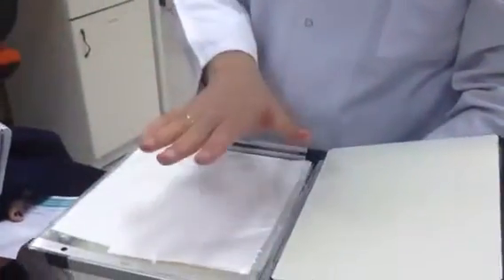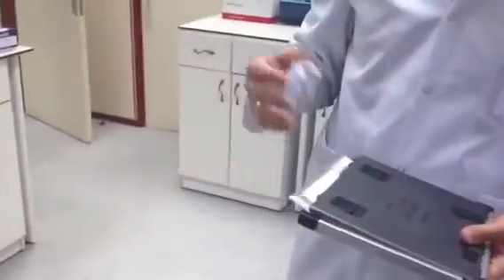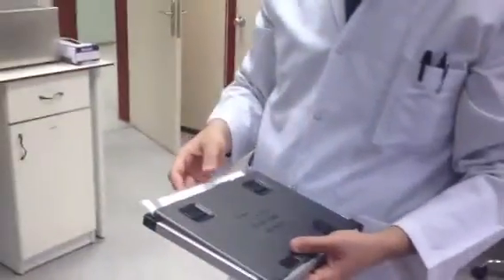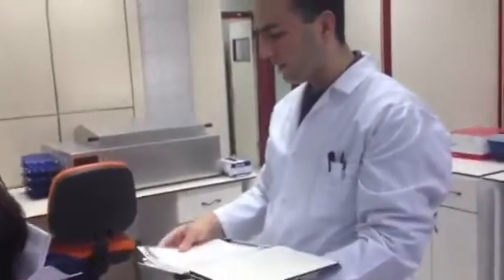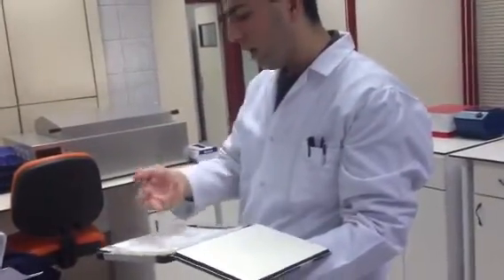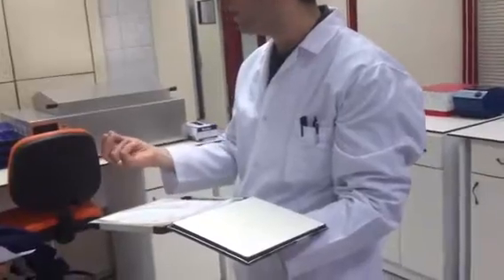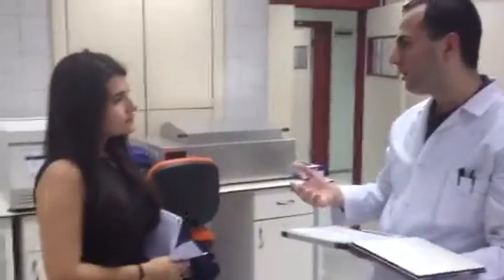Firstly, we put the membranes, and after that the Röntgen film, and close it. After that, we wait 20 hours, one day. After that we open the cassettes and the Röntgens in Röntgen machines, and there are a lot of DNA fingerprints on the Röntgens.